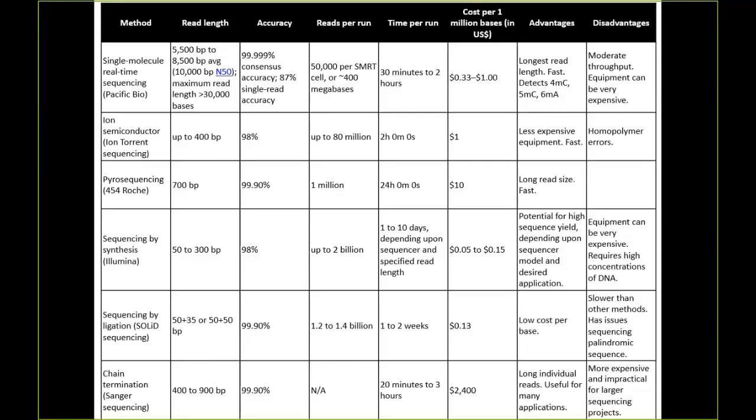You can try and do high depth of coverage where you just read every single base many, many times and hope that that can correct for it. But if your big emphasis is things like looking for genomic variants, PacBio is probably not the choice for you. What would be the one genomic variant type that you would want to pick up with PacBio? Deletions, or more generally, structural variations.